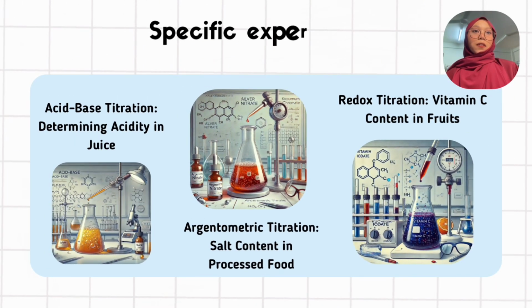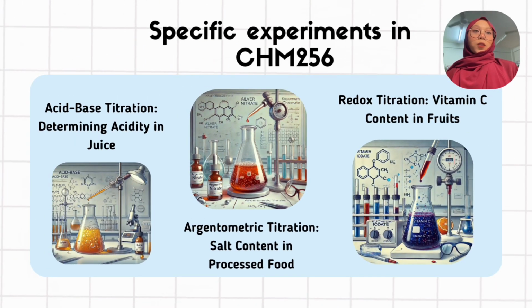There are some specific experiments in CHM256, which are acid-base titration to determine acidity in juice, argentometric titration for salt content in processed food, and redox titration for vitamin C content in fruit.